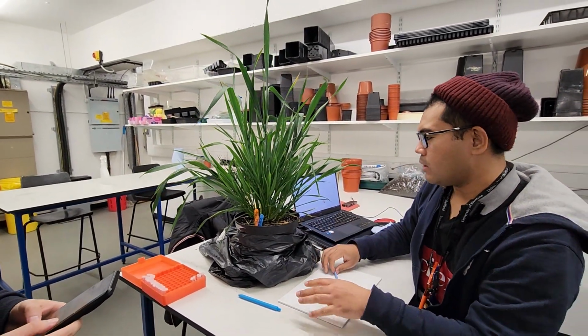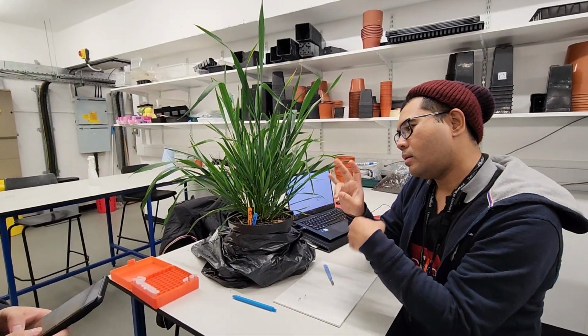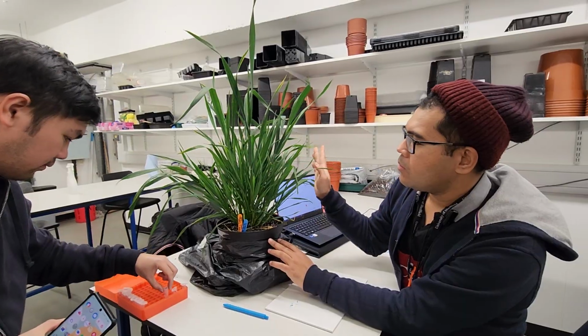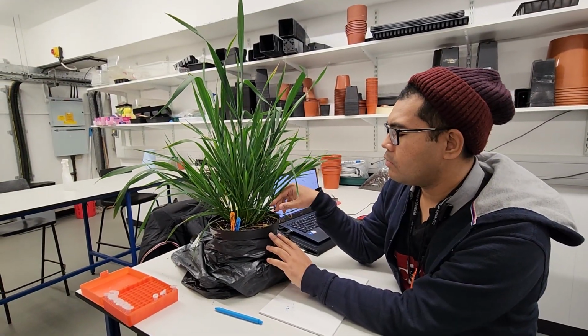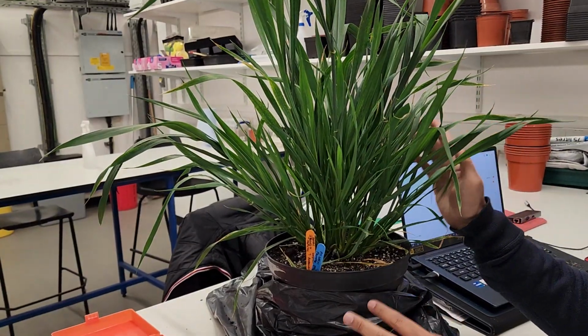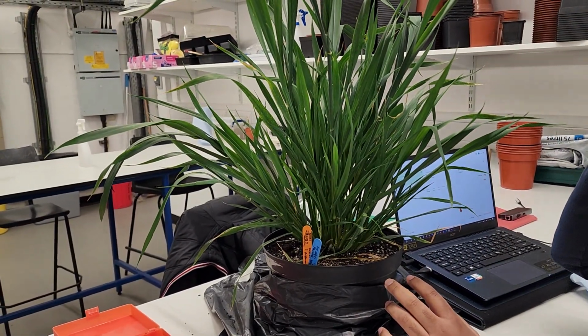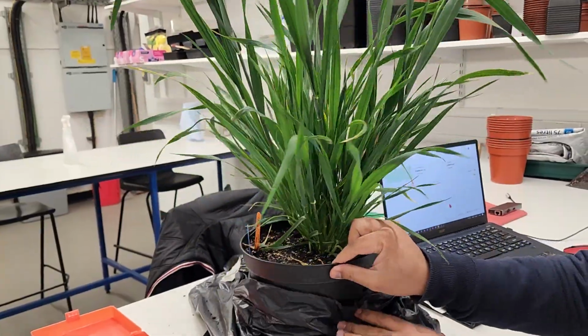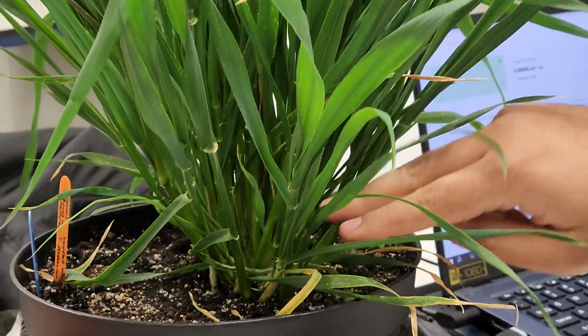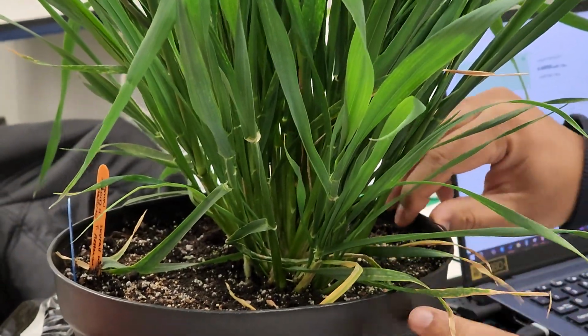So actually we need to sample some tissue from this. Because it's been in the vernalization for so long, nothing is flowering, completely vegetative. So it's got the growth habit similar to rice. They got all this massive tillering occurring. But today we kind of detected something.